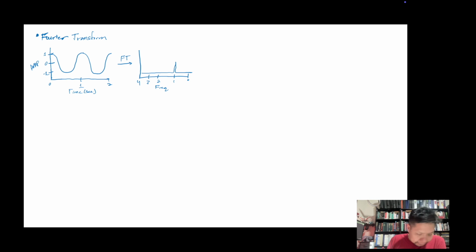So let's do another example. We have a different type of proton now. Again, we are doing 1 second here, and 2 seconds, and 0, time in seconds. This time though, and again, this is very simple, because real protons have way more complicated numbers. We're just using easy numbers here to make it easy math. Again, we'll have amp here for amplitude, and then in the middle we'll do 0, and then 1 and -1. And this time we're going to have a proton that's precessing at a rate of 2 cycles per second, or 2 hertz.